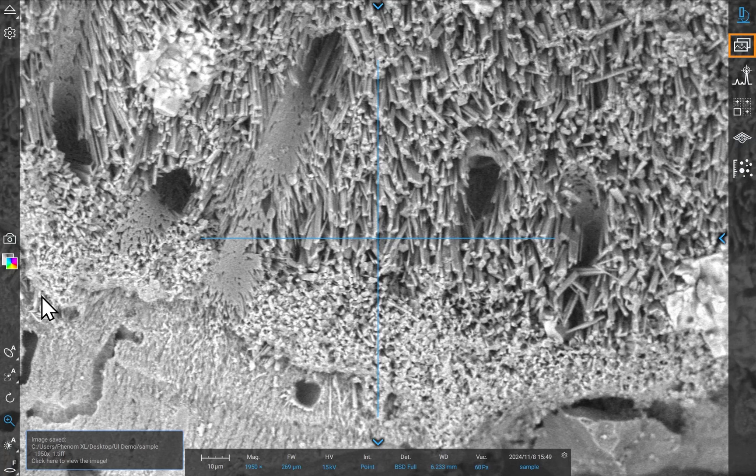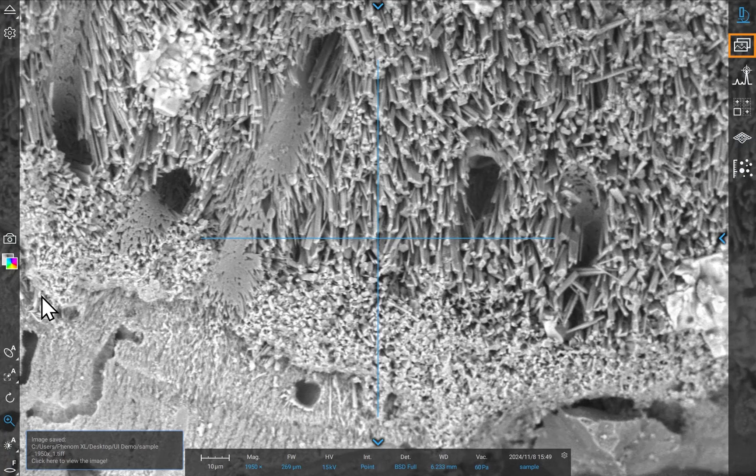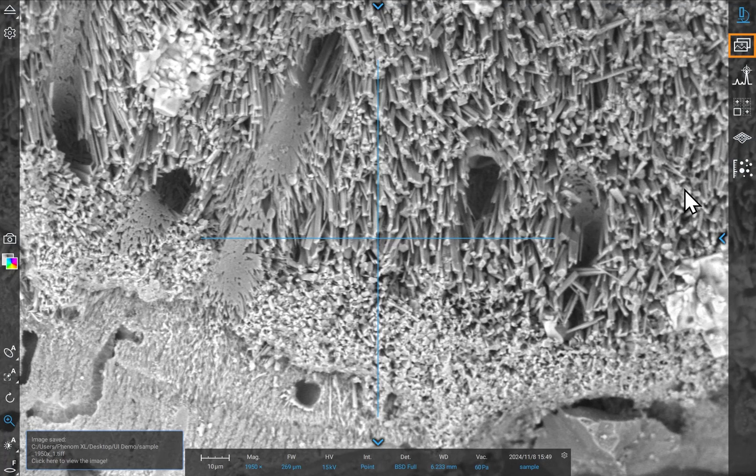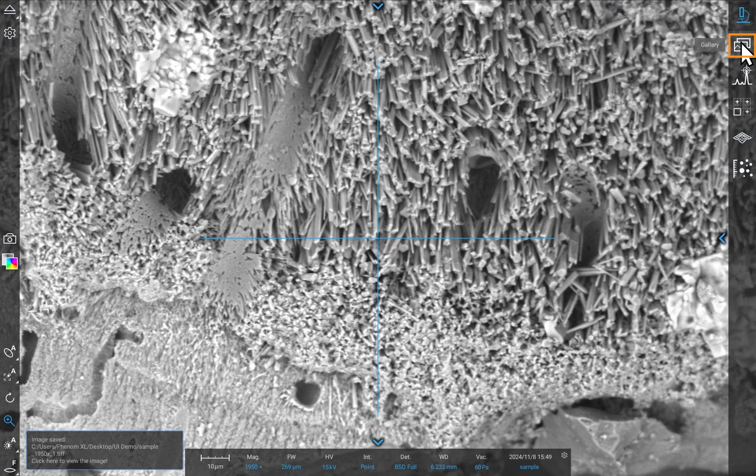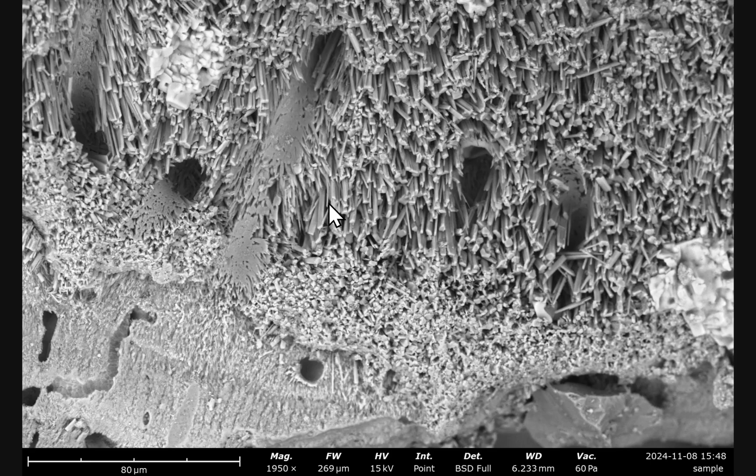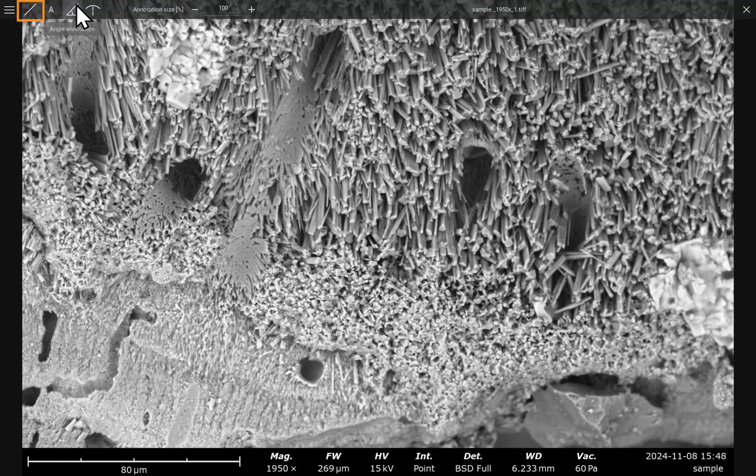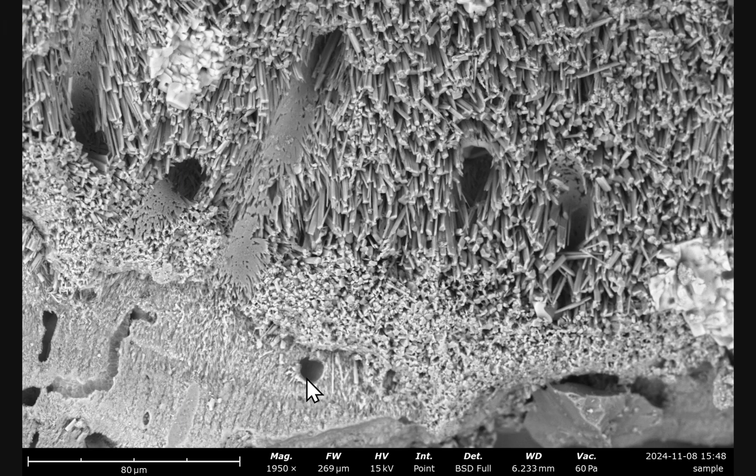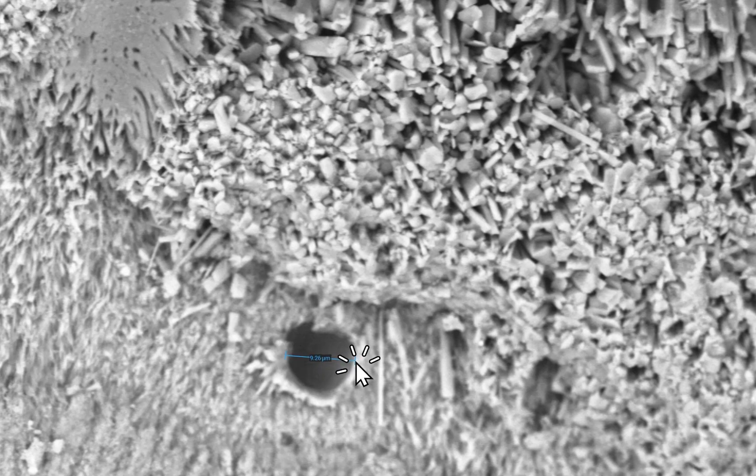Now that you've acquired an image, head over to the image gallery on the right toolbar. Hover your cursor over the top left of the image to reveal the measurement toolbar. Click the line icon to use the measurement tool on the feature of interest. Simply left-click and drag to measure an object.